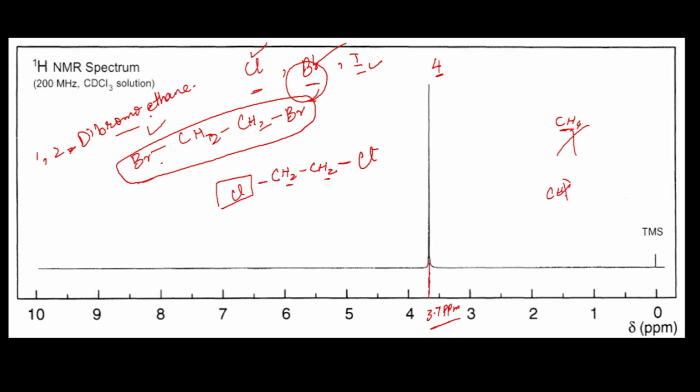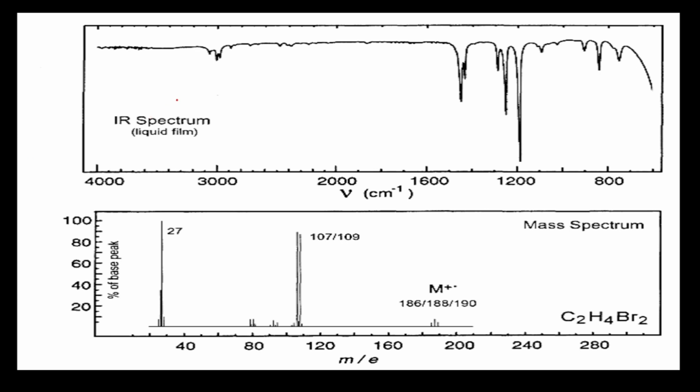So now I told you that we will discuss here the IR spectrum. We are not taking any information as no peak is given here, but from this mass spectrum you are determining very much information. As you can see here, first of all, your main focus should be these two lines.